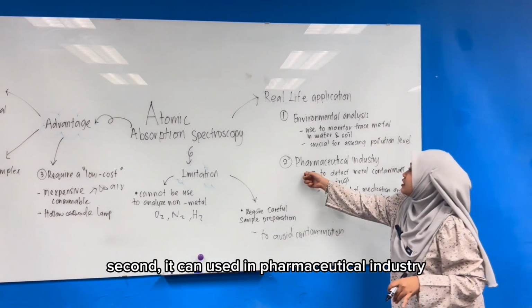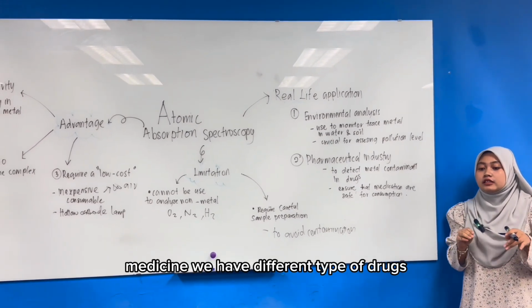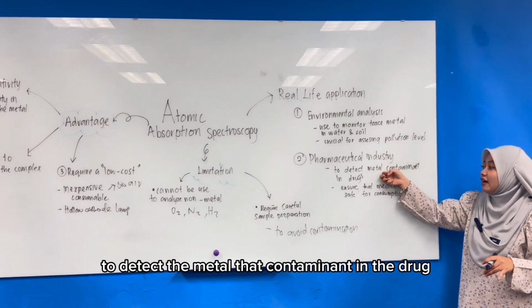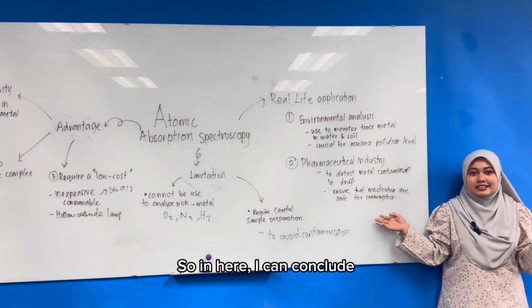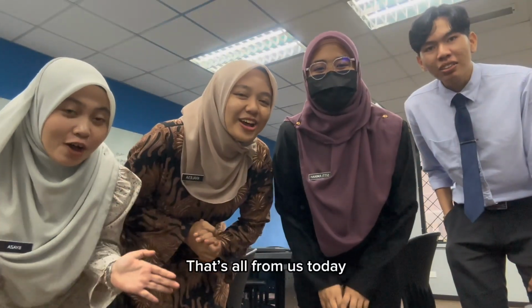Second, it can be used in the pharmaceutical industry. As we know, in medicine we have different types of drugs. It can be used to detect metal contaminants in the drug. From that, we can ensure that medication is safe for consumption. So here, I can conclude that you can find other applications by yourself. That's all from us today.